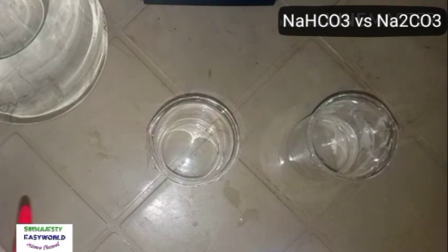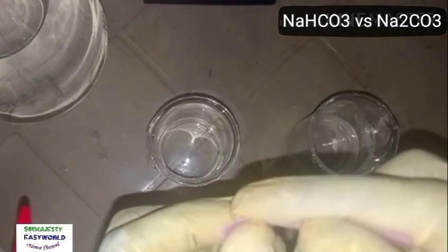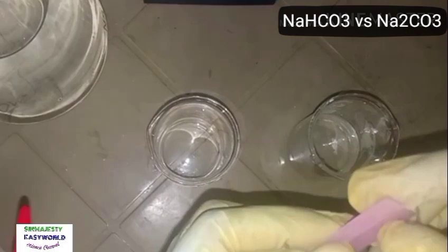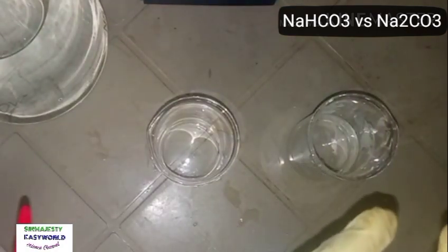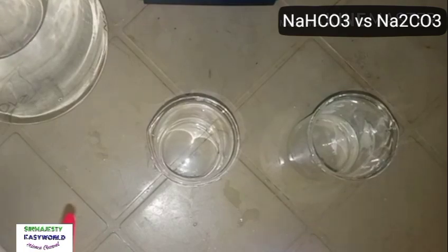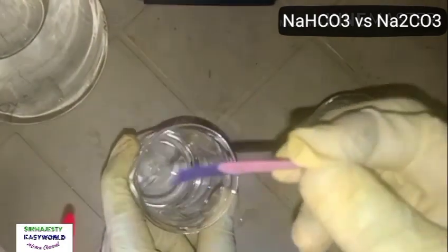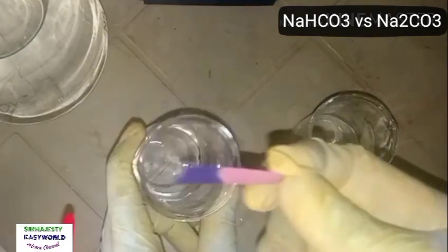So I have my litmus paper. I will detach two. So over here is the litmus. I will insert first on the sodium carbonate. This is the sodium carbonate. If you put it, it changes it immediately.